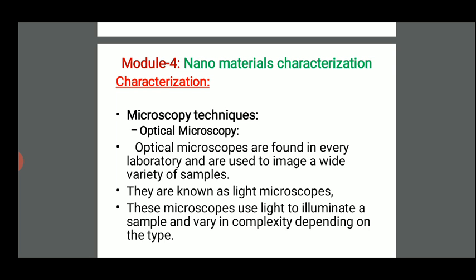Some microscopes use compound lenses to magnify the sample, but anyone who has used these microscopes knows that the magnification is not very high. The optical microscopes are ideal for observing samples that you can see with the naked eye, but in more detail, as well as micron sized materials. However, they don't have the ability to observe nanostructured materials in great detail.